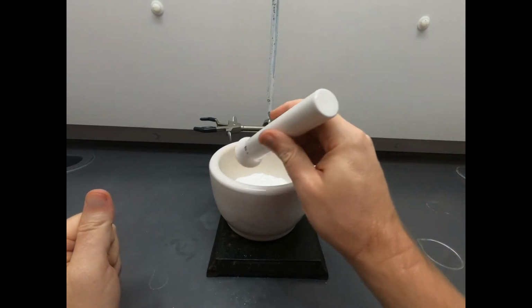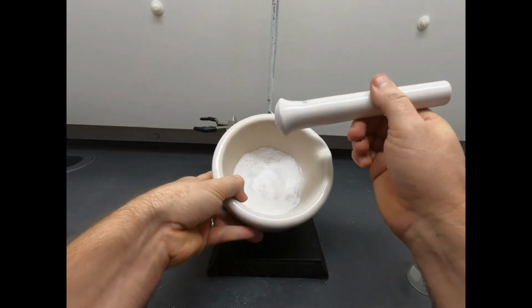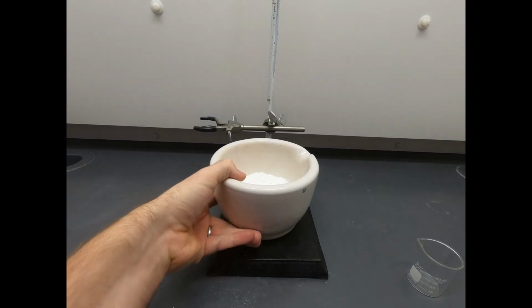As you can see, it takes very little time to crush up these pills. These pills are not made out of rocks. They're made to break down in the body. So they actually come apart pretty easily.